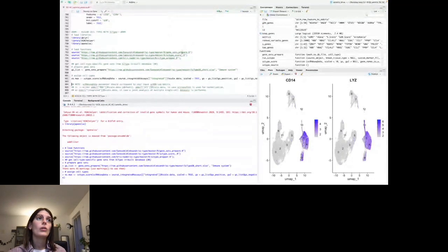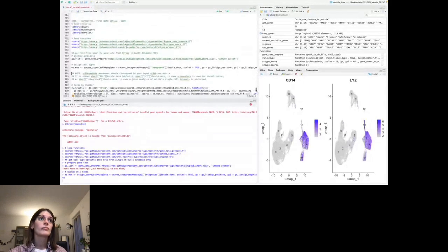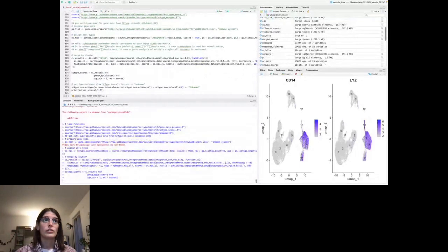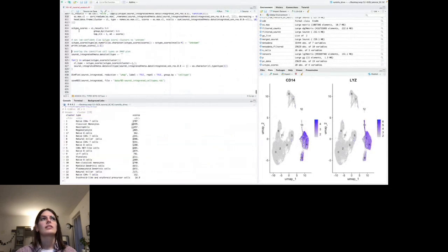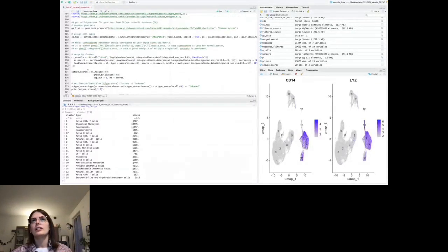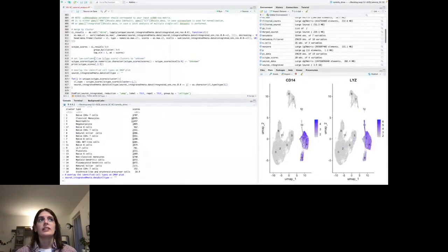So this is all code that is available in the tutorial of the SCtype tool. It looks a bit complicated, but actually it is all explained very well in the tutorial, and you can find it on GitHub. It calculates the likelihood of each cell belonging to each cell type. In here, I selected the immune system cells to annotate our UMAP, and I said that for low confidence clusters, if you are not very sure, don't give them a name, just mark them as unknown.